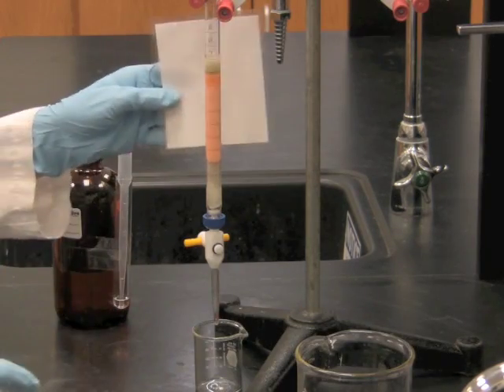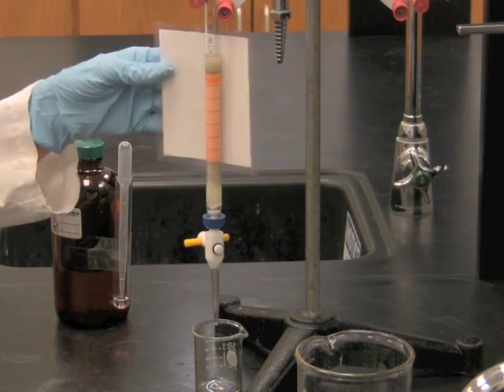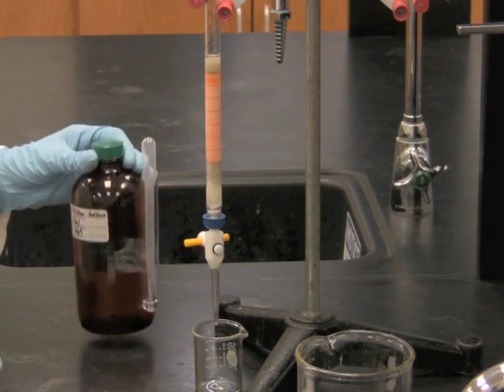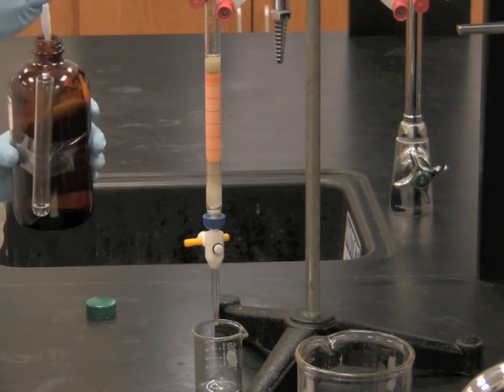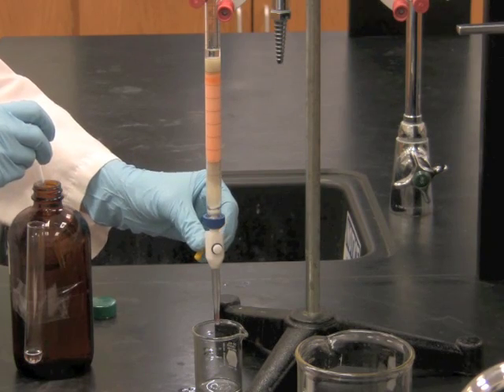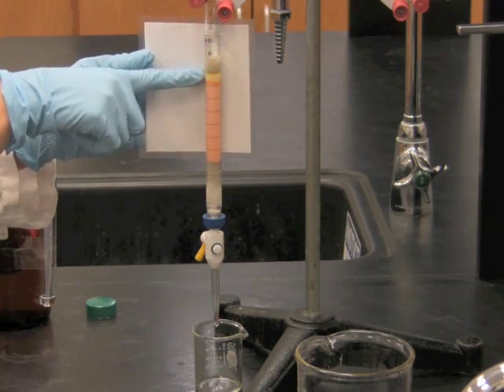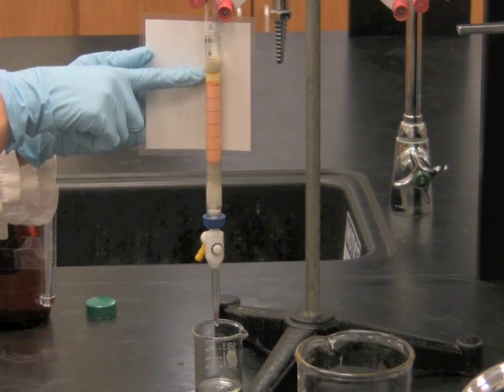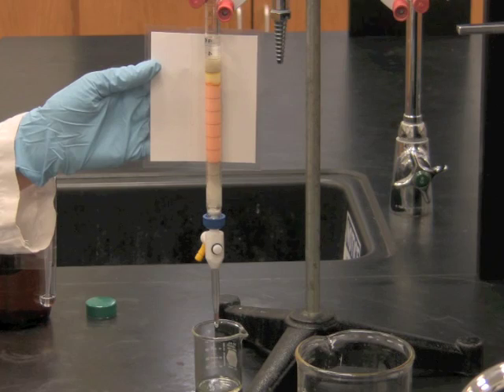We're going to switch solvents and we're going to elute the lycopene band from the column using a 9 to 1 mixture of petroleum ether and acetone. You should be able to see that as the solvent front is moving down the column that the lycopene is starting to come off and come down with the solvent.